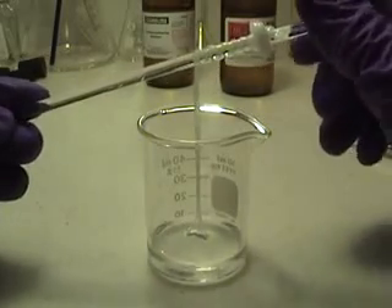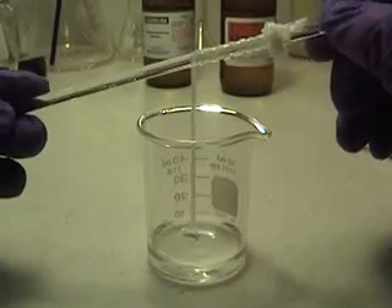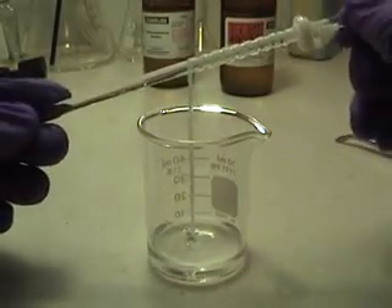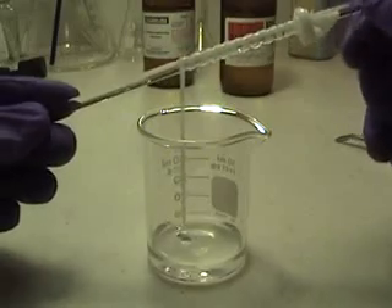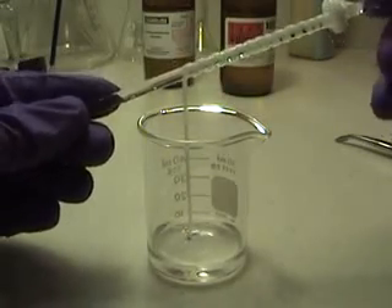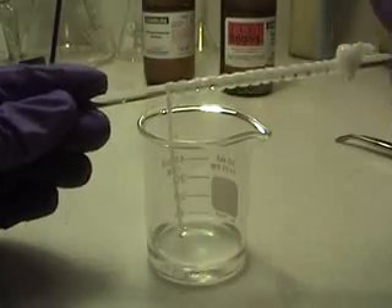Now this is a very small amount and will probably make about ten feet of nylon. I would not really suggest making any more than this because unless you are going to be handing out the nylon, there is going to be no reason to have that much.